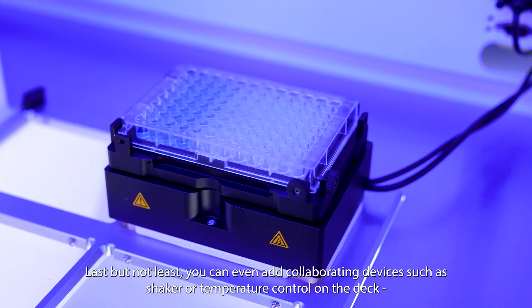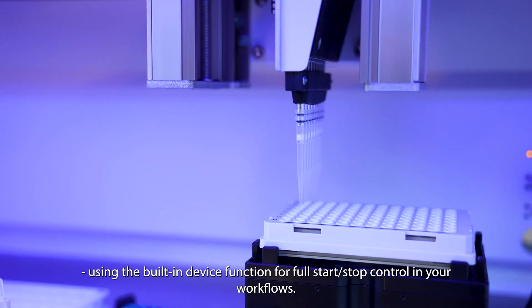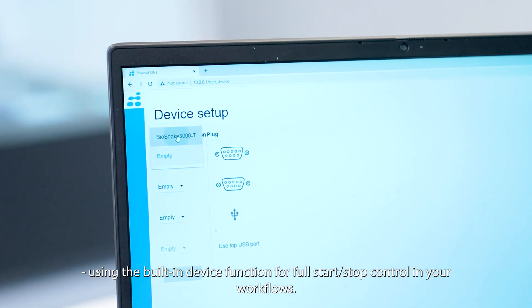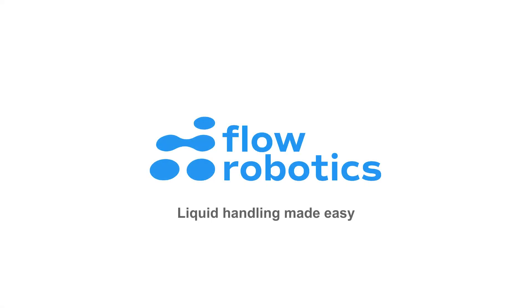Last but not least, you can even add collaborating devices such as a shaker or temperature control on the deck using the built-in device function for full start-stop control in your workflows. Flow Robotics — Liquid Handling Made Easy.